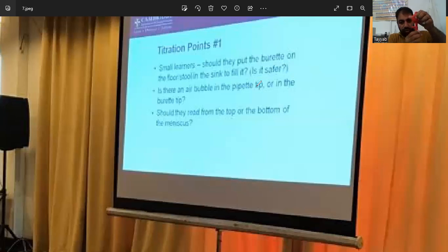This pipette is fitted with a pipette filler. After fitting the pipette filler on the pipette, push this lock button. Here is the lock button. This will create air space, and then push this again. This will help to raise the liquid in this. What is the benefit of this pipette filler? If you suck with the mouth, the chemical may enter the mouth. This is dangerous.